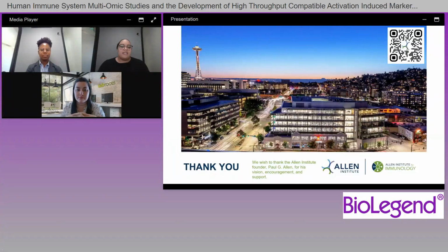Also, one of the things this instrument is really good at is pulling out populations, and something it could be really good for is to monitor CD4, CD8 T cell populations in HIV patients, and being able to do that all over the world, or outside in a parking lot kind of thing, get samples, and process them really quickly in a pop-up facility.